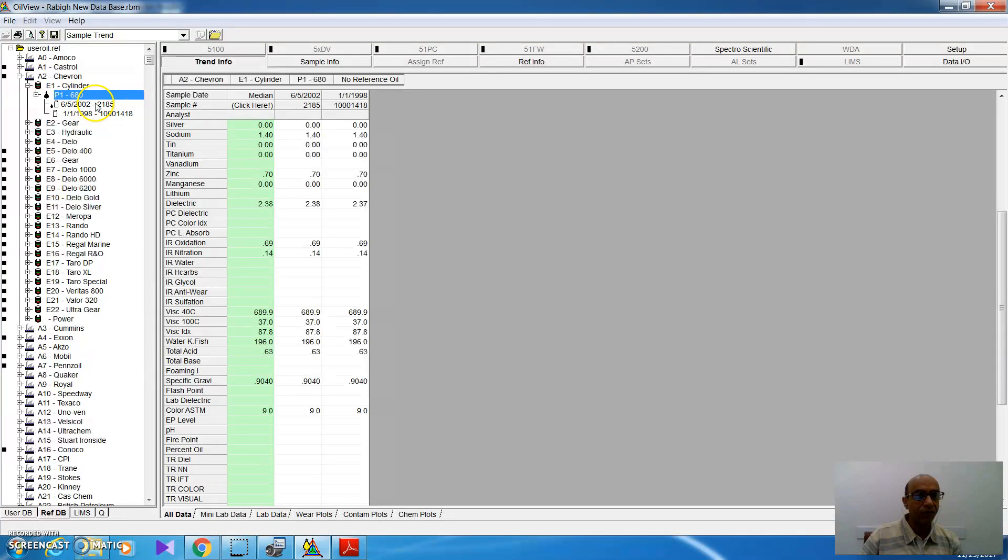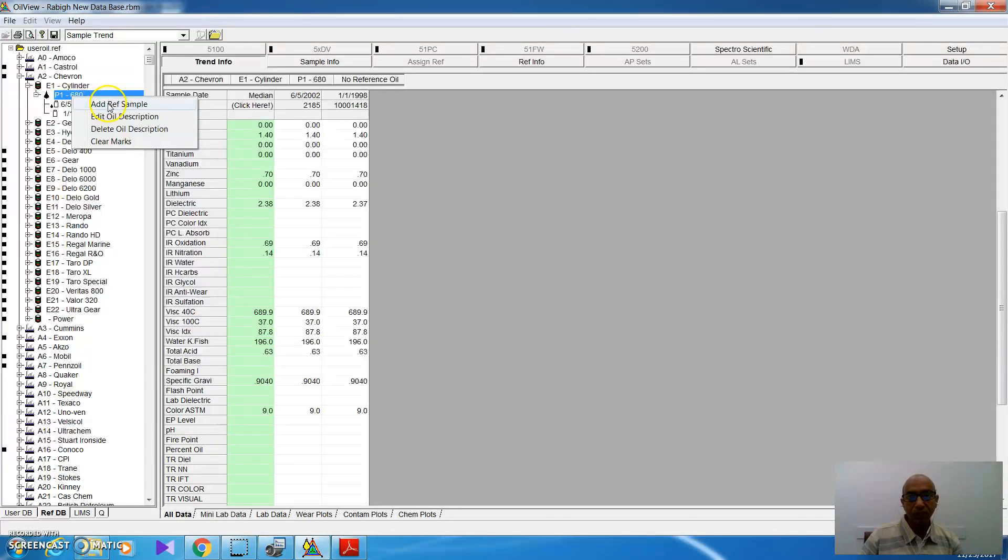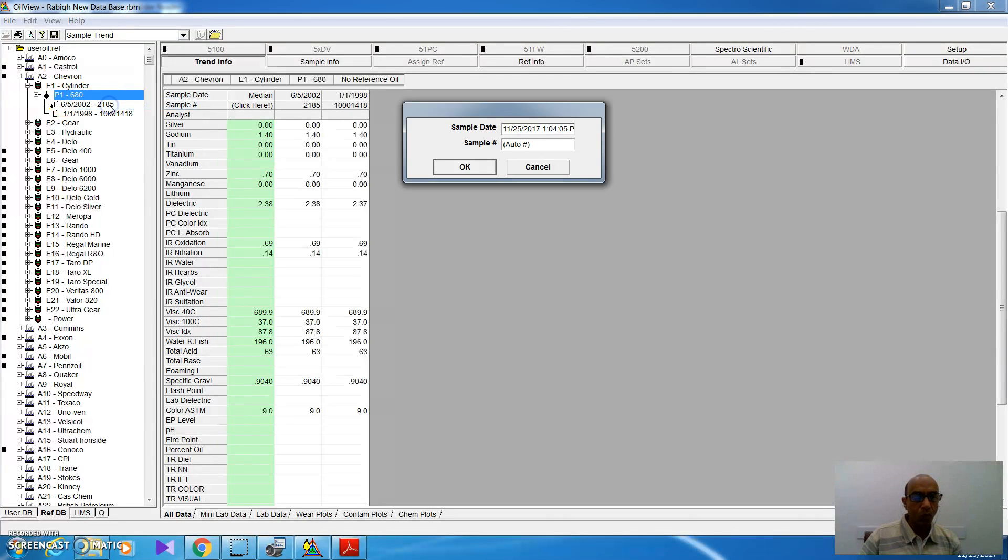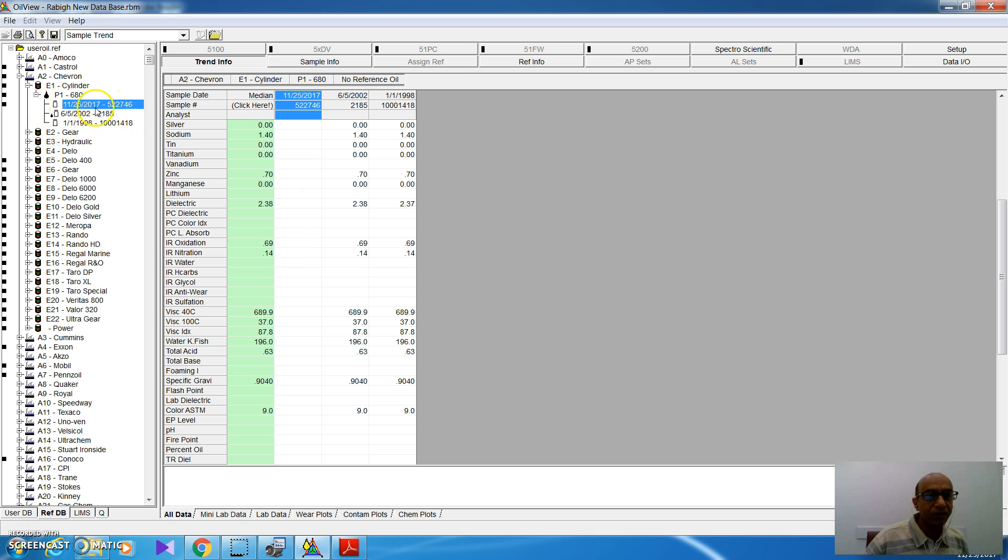If I wanted to add more sample ID, I have to right click, then add reference sample. When I do that, this window will open, then click OK. Now, I opened a new reference sample.